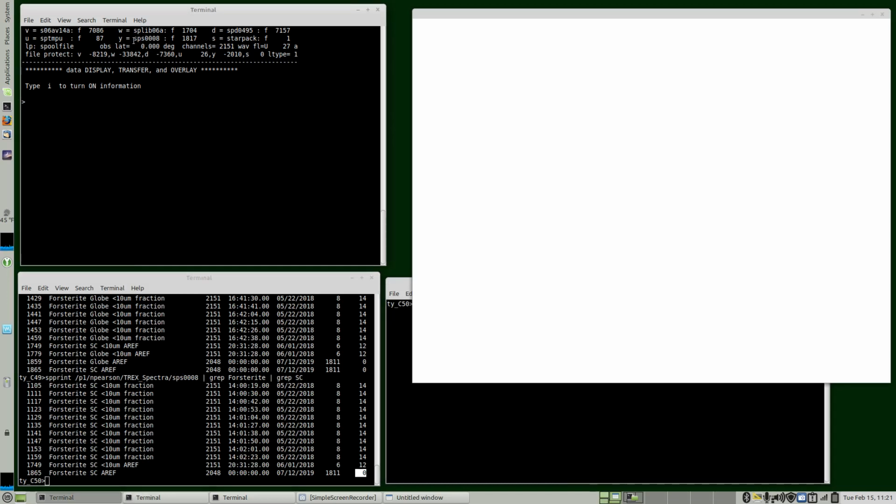So SPS 0008 is assigned to Y, so Y6, copy to U. Y12, the resolution, bandpasses, copy to U. You don't need spaces here.